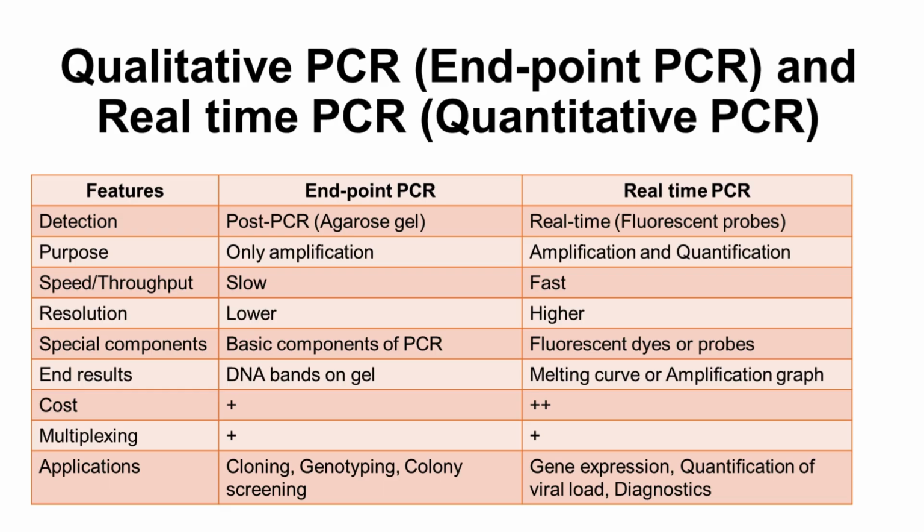And when coming to the cost, endpoint PCR is relatively cheap, but real-time PCR is costly because of the probes that you use. And multiplexing is possible in both, but has high accuracy in real-time PCR.